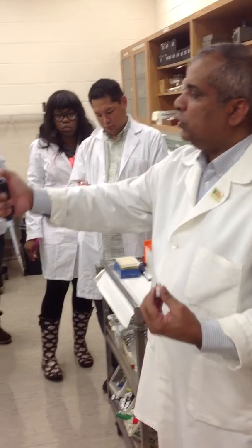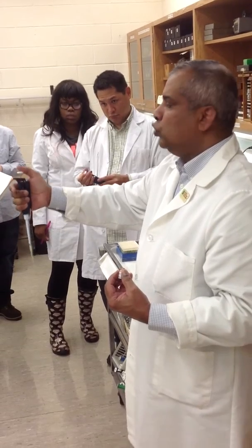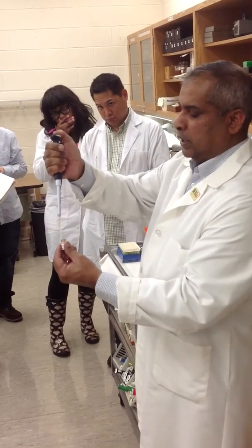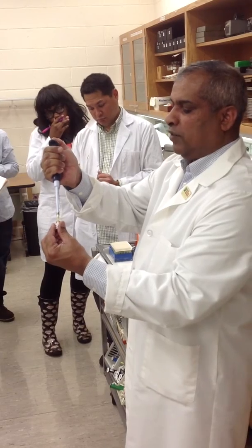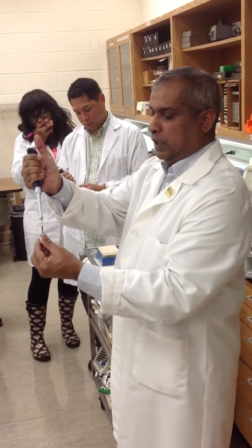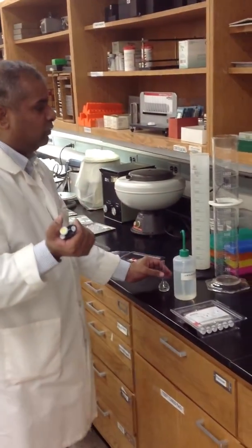So to pipette, you see it goes, and then it goes an extra little bit. When you depress this, don't go all the way down when you're picking up. So you depress, you put it in. You don't want it to touch the bottom, just slightly off the bottom, and then you release slowly, because you don't want bubbles to get in here. Usually you can get a Kim wipe and wipe that off, but if you do it carefully, you don't need to.